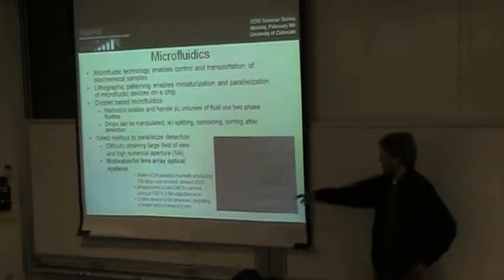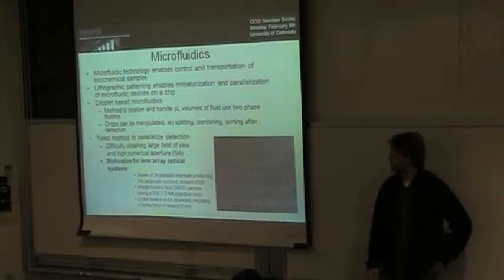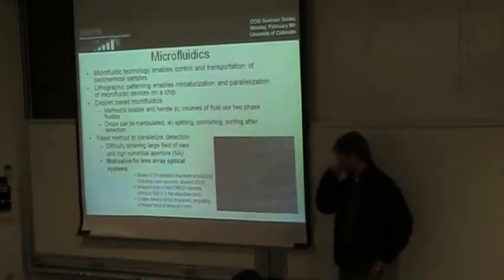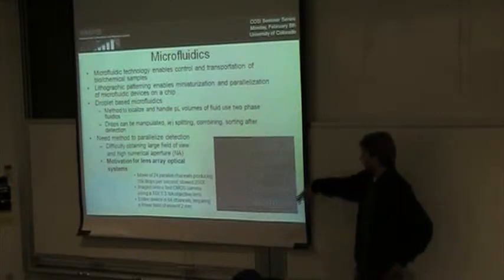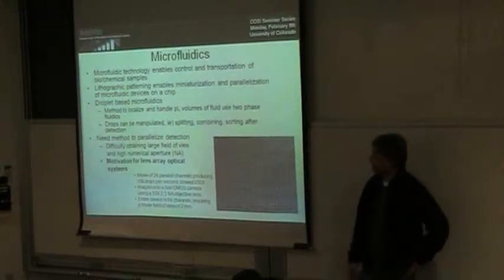But these water droplets are basically spit out of a nozzle at rates of anywhere from hundreds a second to several thousands per second. And then we can parallelize this. So the device that we fabricated was a single flow-focused drop maker. It was then split many times, 64 times, to create an array of these drops with which we want to measure and detect the fluorescence inside.